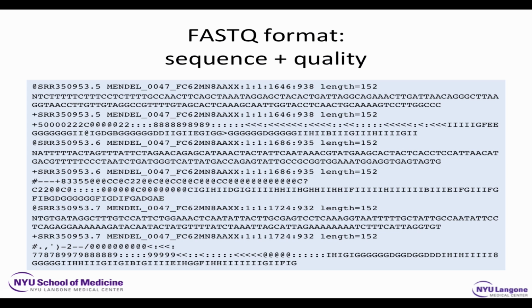working with today, and that's the data that you would typically receive from the sequencing lab, either if you work with the GTC here, or you work with a collaborator, or you downloaded a file from a public database, or you sent out your sample to a commercial sequencing lab. FASTQ is the sort of universal file format for communicating raw results from DNA sequencing experiments.